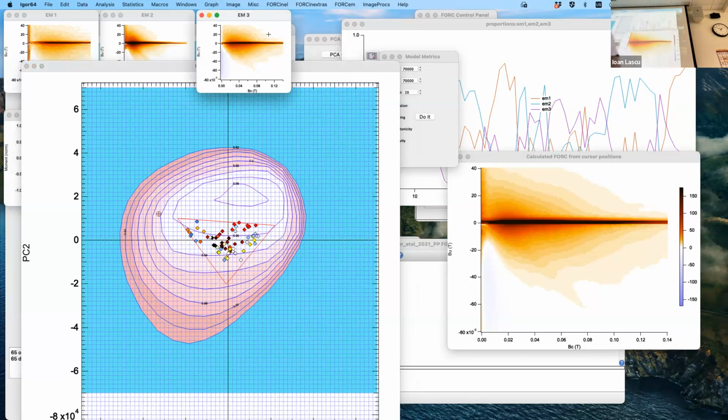So, okay. Yeah, like I said, these are guides and they're trying to make your analysis more rigorous, but in the end, it still relies a bit on common sense and your experience. But I think the rule of thumb is, try to choose the smallest simplex possible that encompasses all your data. The risk you run into here is that your end members will be mixtures of components. So they won't be pure if you get really close to the data, and those data points that are close to the end member are not pure end members, but are combinations themselves. Does that make sense?